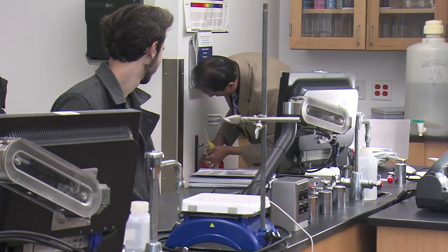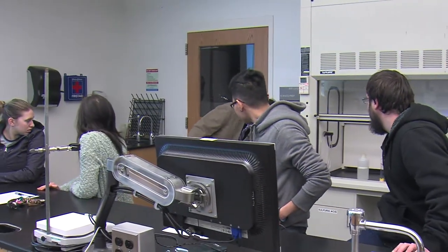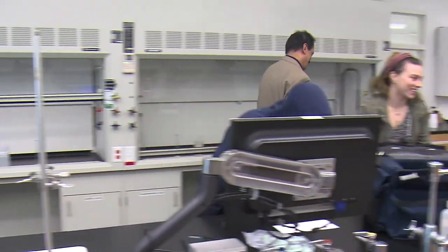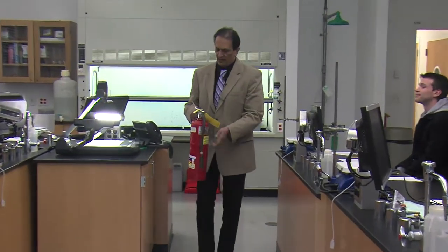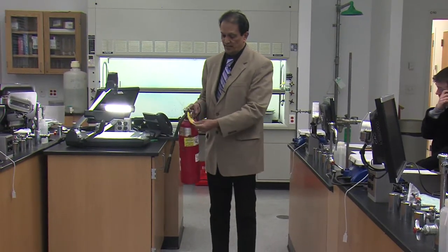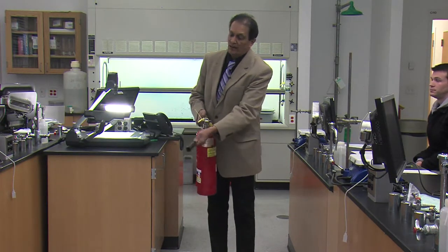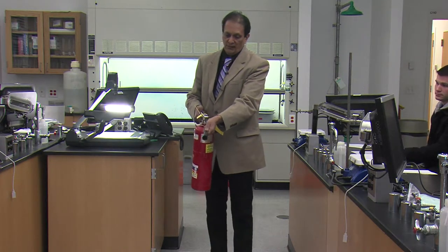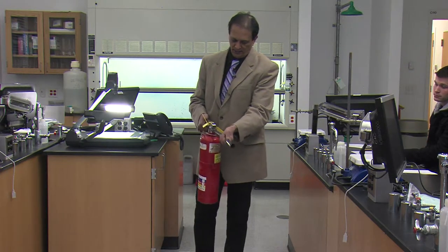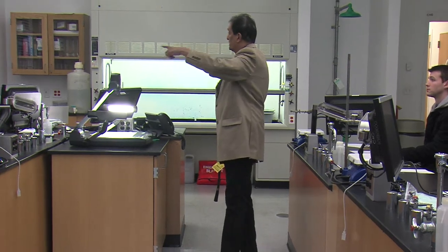In case of an emergency, and as you can see, in case of emergency, we will scream. I'm going to show you this fire extinguisher that is present, and how to use this. These are maintained quarterly. Somebody comes and checks it, and there is a label. You will break the seal, all right? You will hold this and aim it at the base of the fire, all right? We need to press this, okay? And you might have seen this used in films and so on. It gives out a sort of noise when you use this, all right? So two fire extinguishers at two corners of this lab.